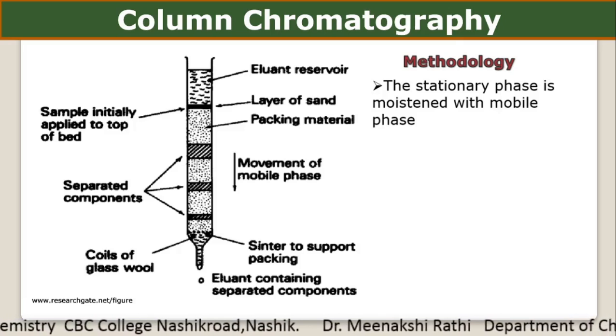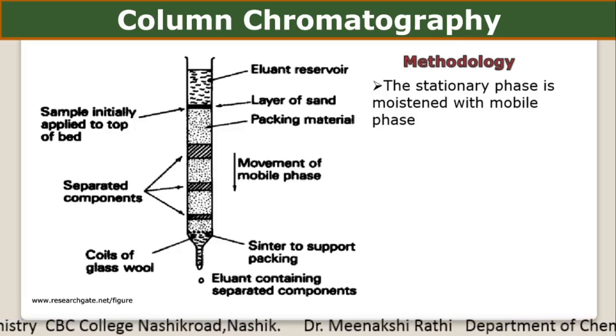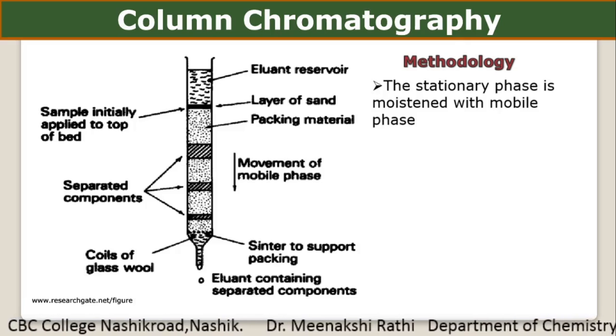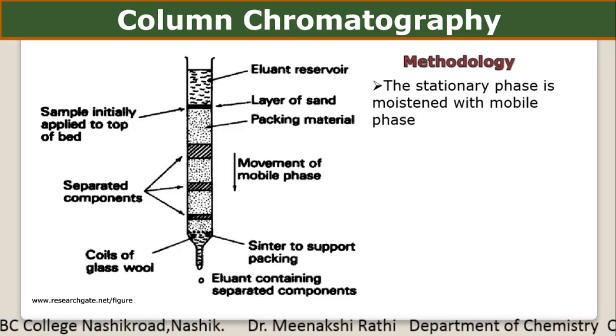Toluene plus ethyl acetate, then petroleum ether, these mobile phases can be used.